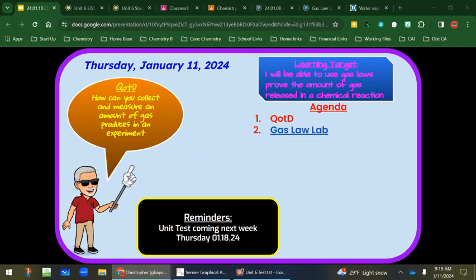So in our container, we will not only have the gas from the experiment, but we will also have a gas from water. But we don't want to know how much water we're collecting. We want to know how much gas from the experiment we're collecting. So that creates a challenge for us today too, and we're going to show you how to handle that throughout the lab today.